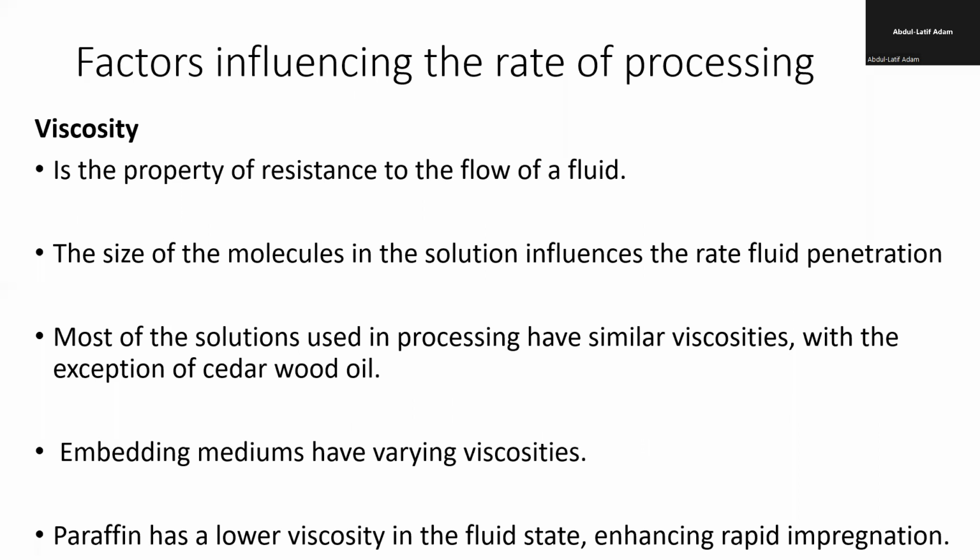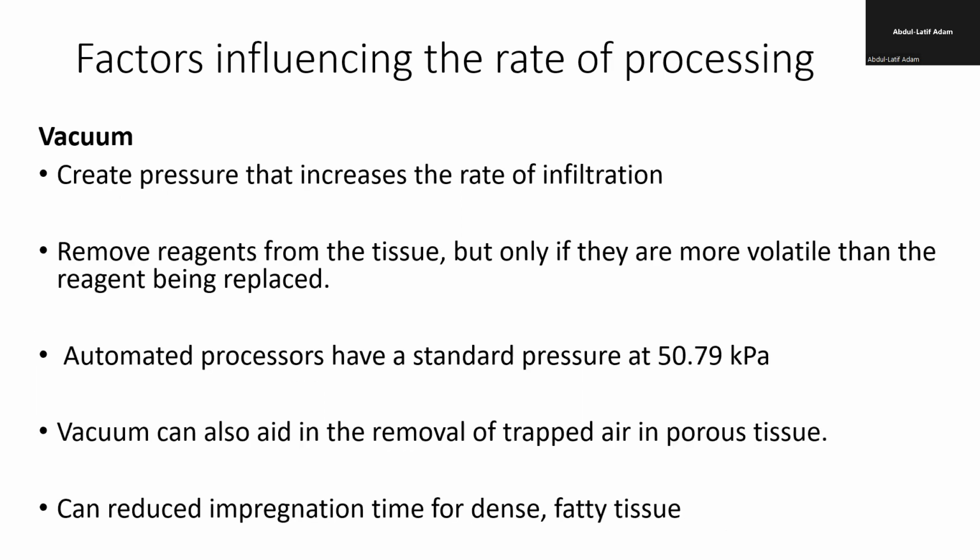Viscosity, just like when we were talking about the clearing agent, it shouldn't be too thick. Fluid has to flow, okay, it has to flow. If it doesn't flow, then it will not enhance penetration, especially when it comes to the molten paraffin wax. It has to be fluid so that it can penetrate and fill up the tissue.